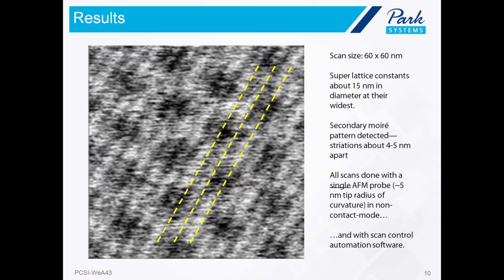Okay. Is it possible to get images with higher acquisition time? And there's a follow-up to that. I mean, let's see here. I see from the last slide that you have used high-speed AFM. Okay, so what's being talked about here, I guess, is the last slide in the presentation. Let me go back to that.